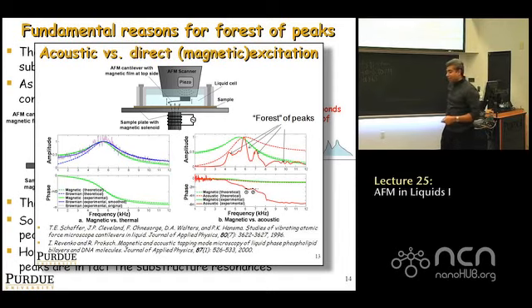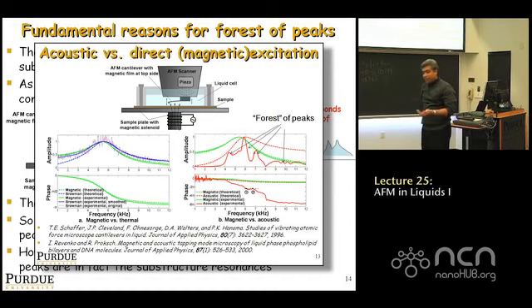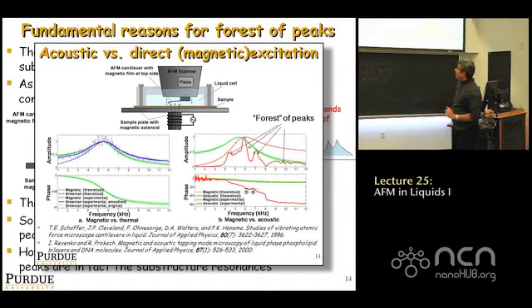So the key point is, in water, the Q of the cantilever becomes lower than the Qs of these resonances. And what you see then are these resonances. In air, the Q of the cantilever is much larger than these resonances, so it stands out. It's the sharpest, tallest peak. But in water, the Q of the cantilever has come down a lot. And so the peaks that you start seeing are actually peaks of these other resonances because their Qs are larger. Okay? This is one of the key things that happens. So this is the main mechanism for this.